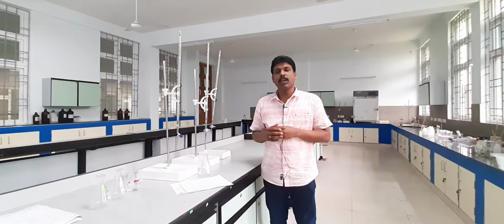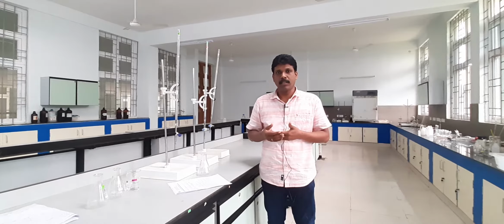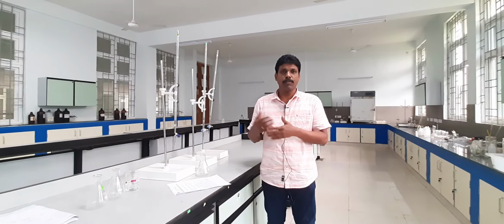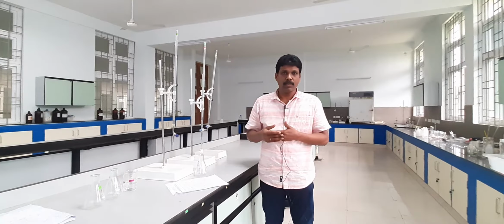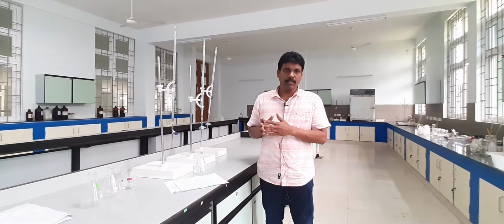And in this video I am going to show you how to take the readings, and after taking the readings I will be posting the readings to you, so you have to do the calculation part. So, this demonstration is only for taking the readings, okay?